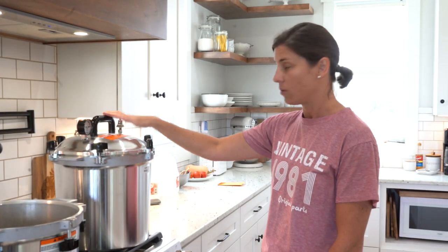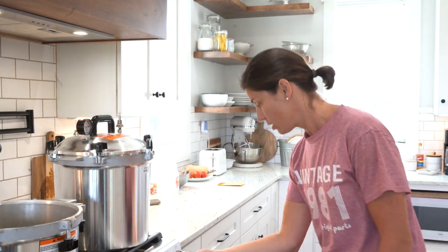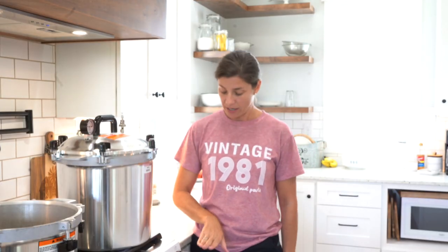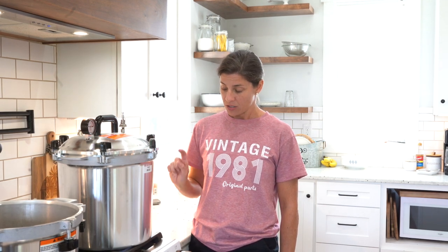We have everything ready to go. We are going to turn our burner on high. I do want to point out that you do not want to use these on a glass top stove. If you have a glass top stove, I would recommend getting some kind of outdoor burner that you could use with a propane tank, because the weight of these could crack your glass top stove.